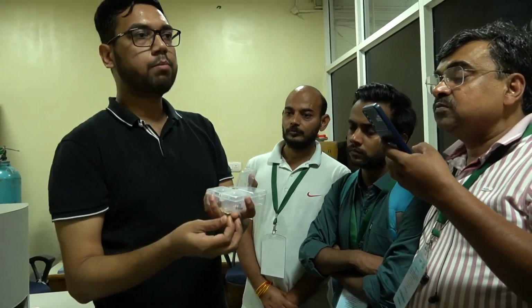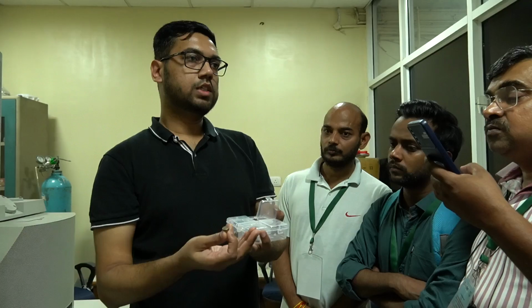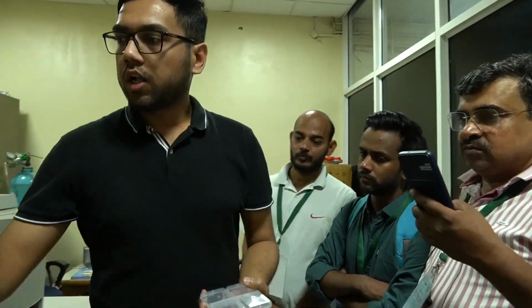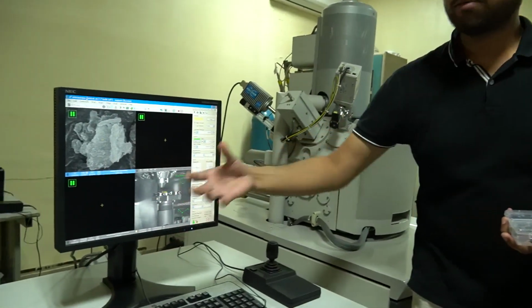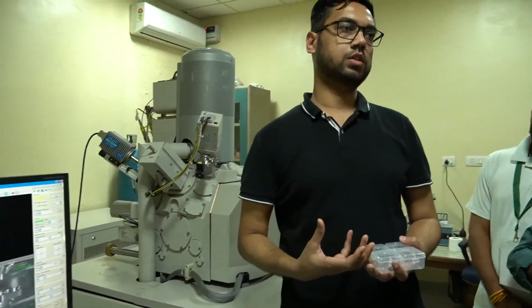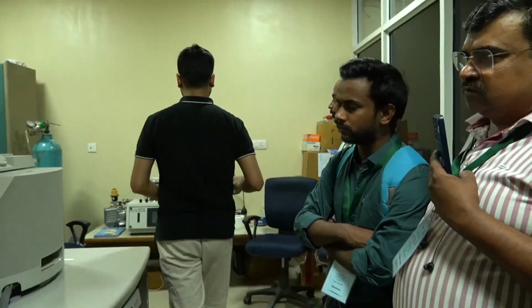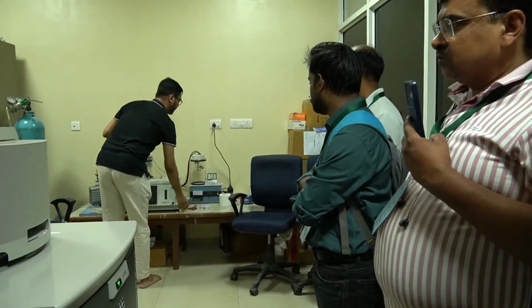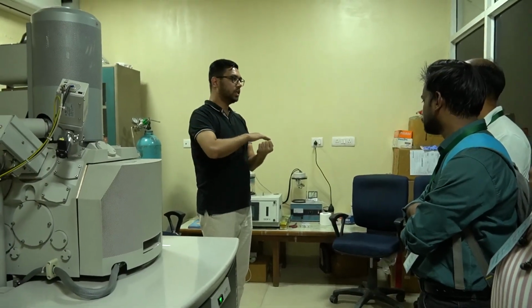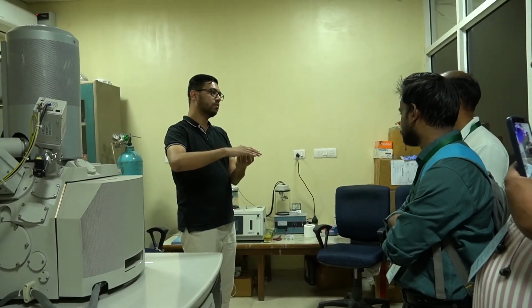Sometimes our sample is not very conductive. It has insulating properties, the surface is insulating. In that case, all the electrons are going to accumulate on the surface, so we cannot get a perfect signal. We cannot capture those electrons. So in that case, we use a sputtering unit to sputter a conductive layer over that sample. It will generate a conductive path over the surface, and all the electrons passing on the surface will pass towards this sample.